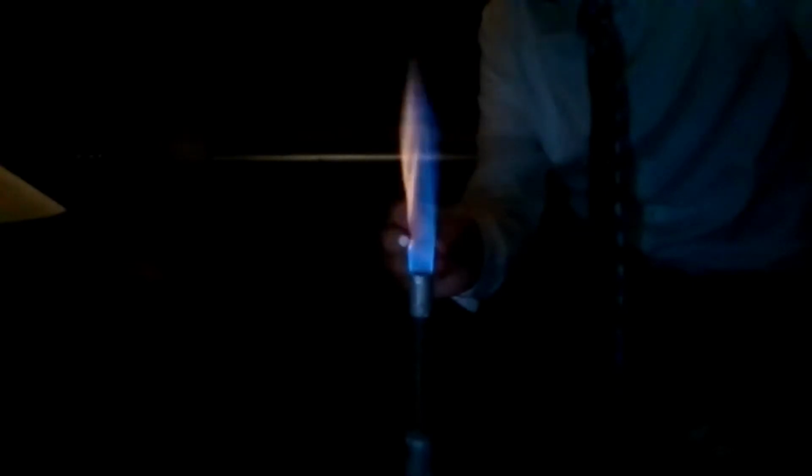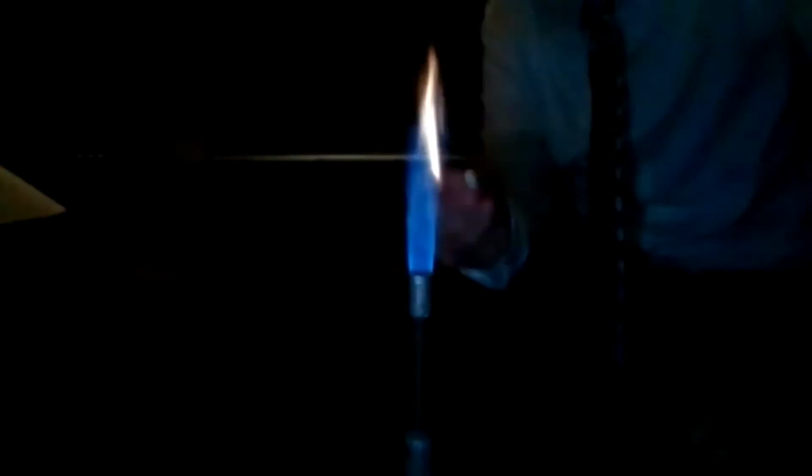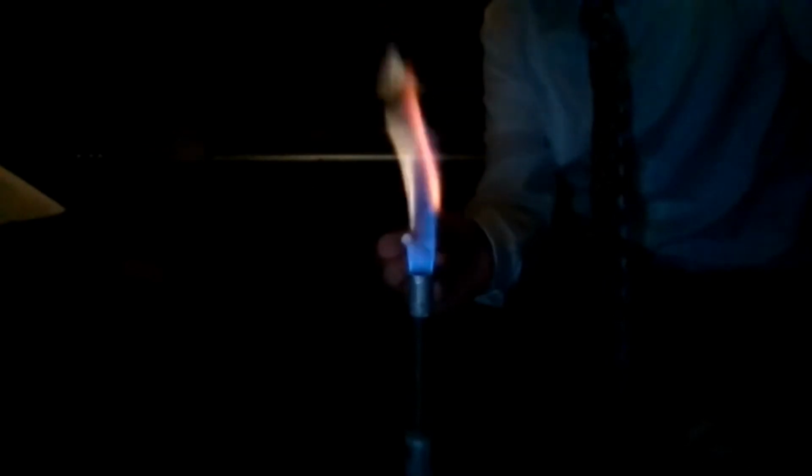So in this case, look at the very tip of the flame. Do you see how it has that bright yellow for a second? Yeah. In this case, it's going to be that bright yellow. If you could see it here, the whole flame actually turns a yellow color. But it looks like it's a bit too bright. But it turns out a cool yellow.